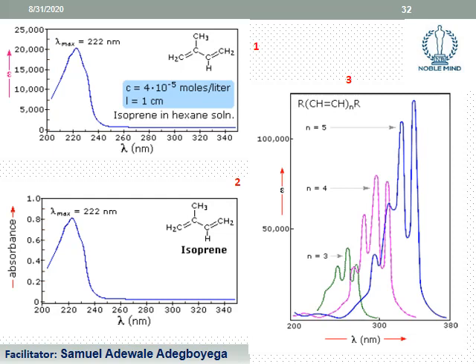You prepare the concentration by yourself. The cuvette you are using, you know the path length, so you can easily get the absorbance. And the moment you get the absorbance, it becomes easier. By substituting those values, you get the molar absorptivity. So to obtain the values, or to interconvert between molar absorptivity and absorbance and the like, just play around with your Beer-Lambert equation.